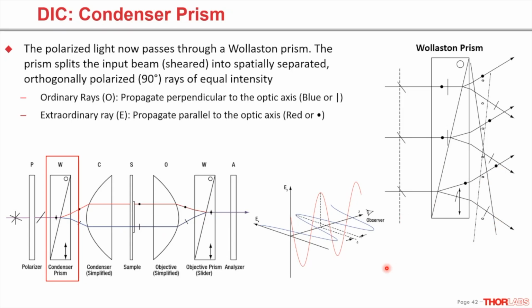What that phase delay looks like in space, as you can see in this diagram, is a shift in the peak amplitudes. One of the waves slows down with respect to the other, and so you get this phase shift between the two peaks of the amplitudes. That's what we're referring to when we say that one is ahead of the other. It's the peaks and where these amplitudes line up.